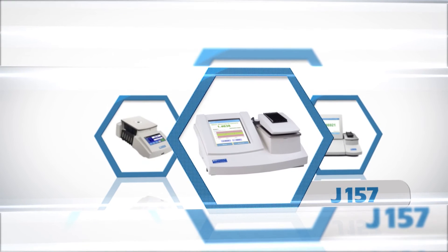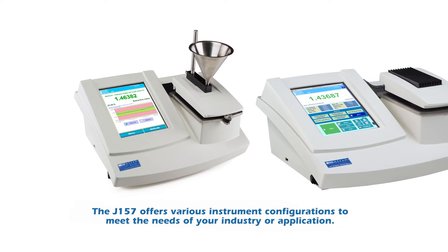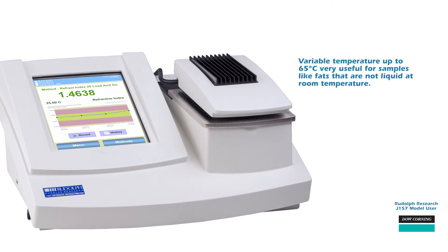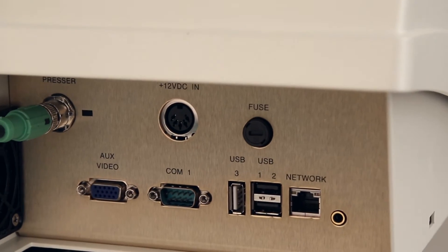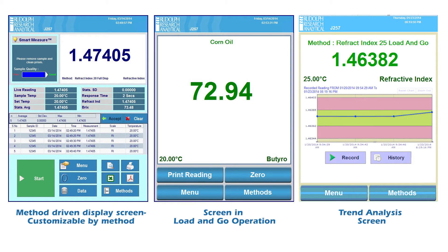Are you looking for a solution for measuring food samples with the best accuracy possible, or working with chemicals? Then the J157 may be your best solution. The J157 offers various instrument configurations to meet the needs of your industry or application, with features to make your work easier and measurements more accurate. Variable temperature up to 65 degrees C is very useful for samples like fats that are not liquid at room temperature. Utilizing a Windows 7 embedded OS, USB printing and saving data are easy and straightforward. The network port allows for easy data exchange, and adding standard and custom scales is not a problem. Users can also create their own methods to match their workflow, sample, or industry.